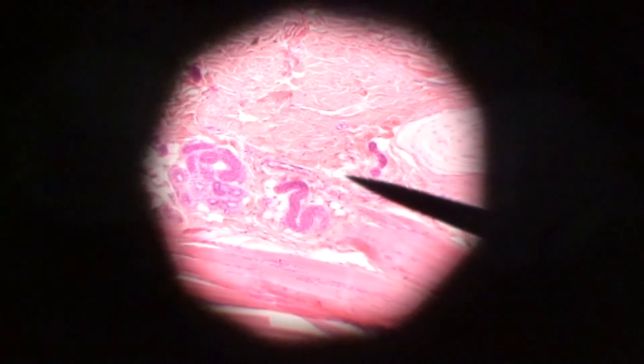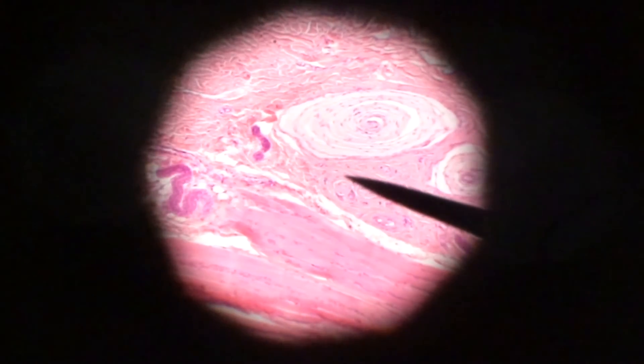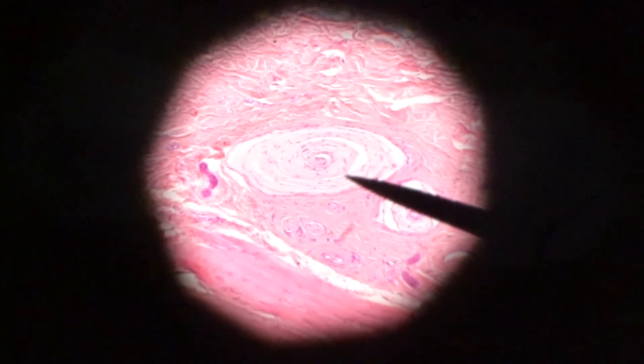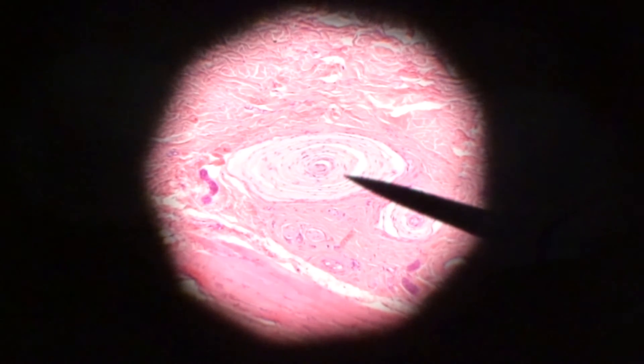All right, these are really easy to find because they look like an onion cut in half. Here's one right here so you can see the onion rings that are right there. This is your lamellar, also known as Pacinian corpuscle, deep for deep pressure.